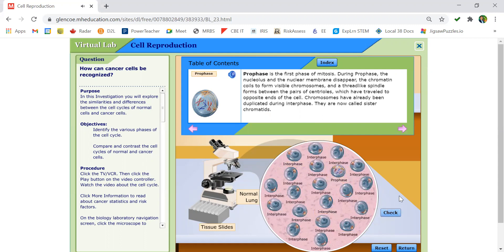Pause the video now to record the number of cells in interphase as well as the four phases of mitosis. Remember the four phases of mitosis are prophase, metaphase, anaphase, and telophase.